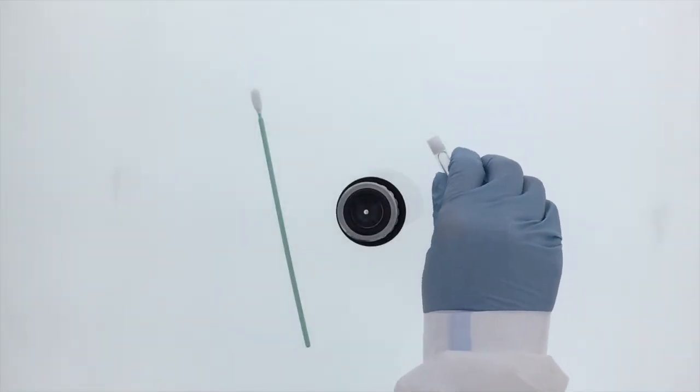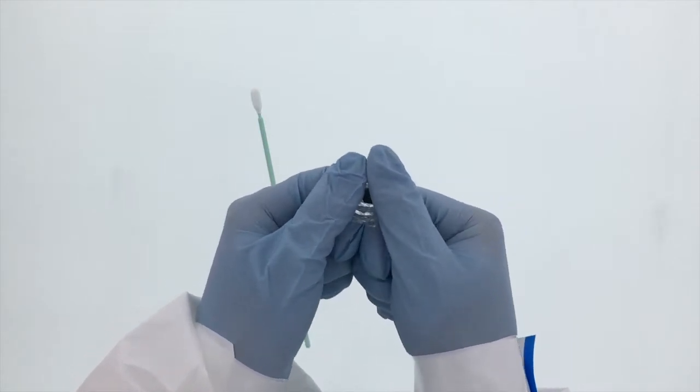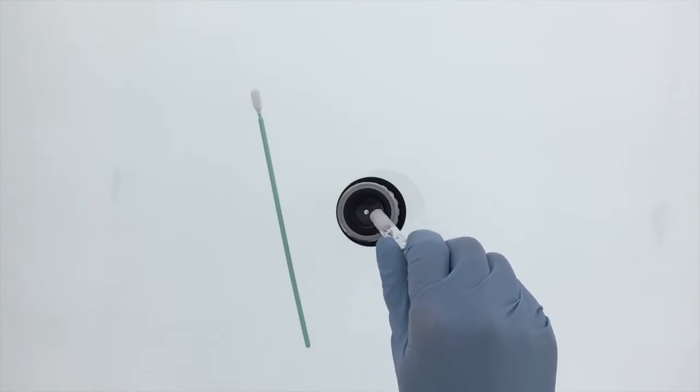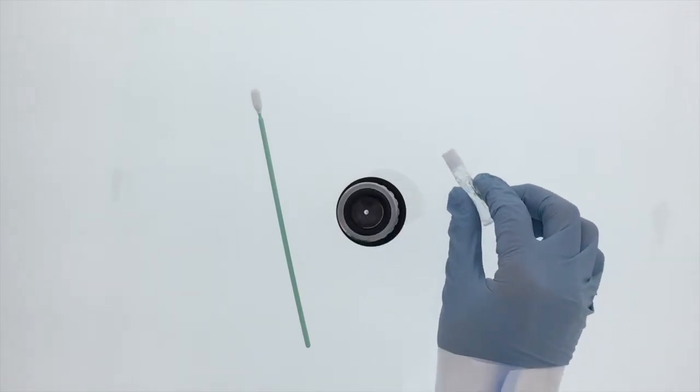Applications include the following: solvent cleaning and maintaining of ion emitter tips, the cleaning of optical lenses, the cleaning of grooves, tracks, slots and other small spaces, removal of adhesive build up, and solvent cleaning of sensitive surfaces such as optical assemblies.